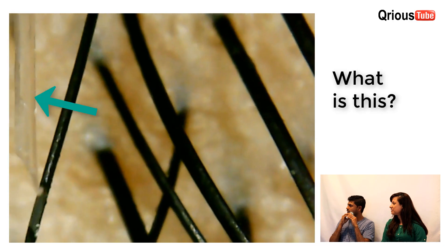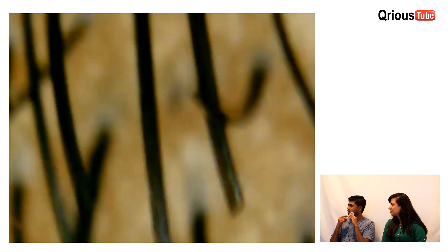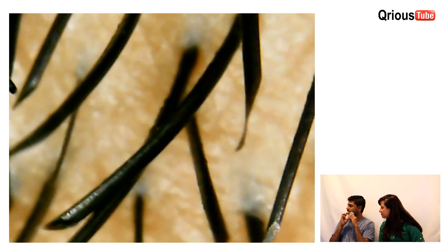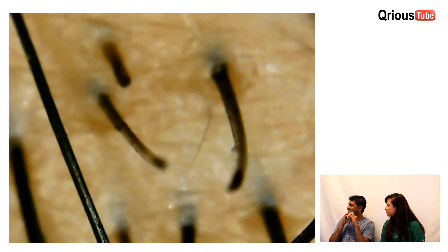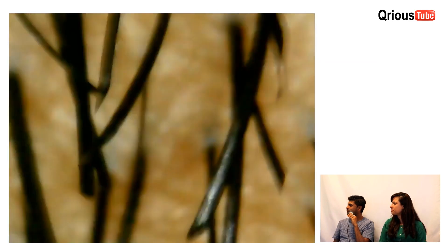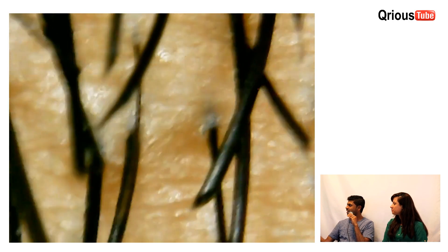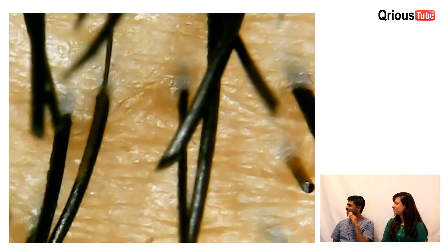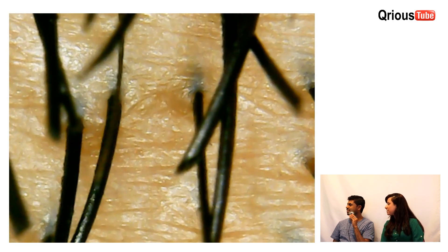Whoa, what is that? Do you see the sharp edge? Now it's more clear. Oh wow. It's coming out of the skin — now it's growing. See that? Yes. Wow. Oh my god. Very interesting.